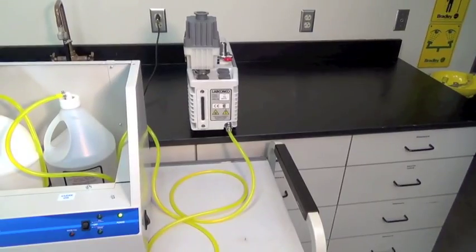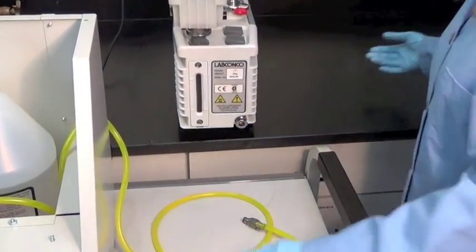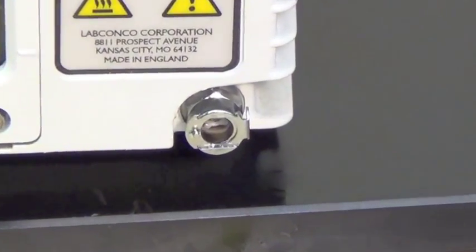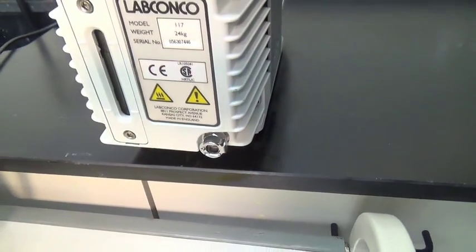When the oil change is complete, disconnect the fill hose from the pump by pressing the tab on the side of the quick disconnect. The coupling on the pump can remain installed for future oil changes. Disconnecting the hose is essential to prevent damage to the vacuum pump.